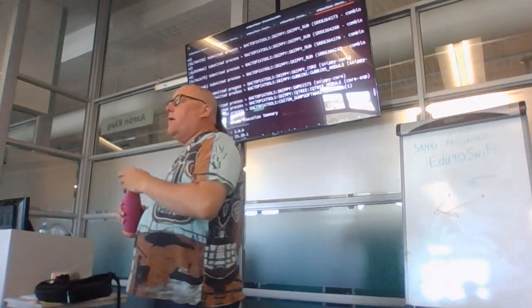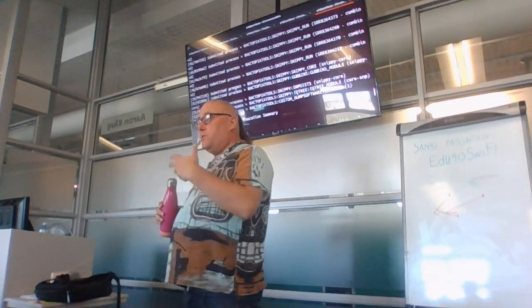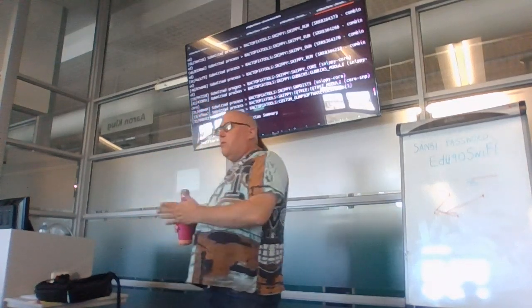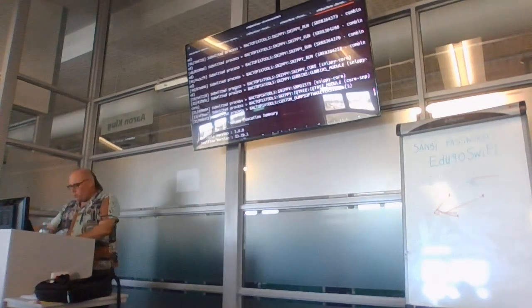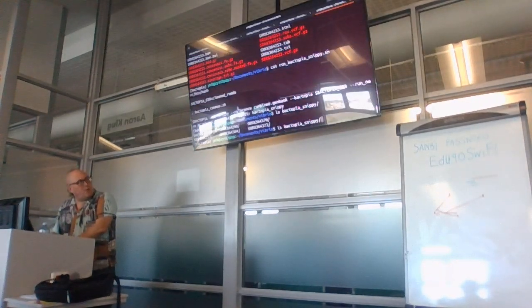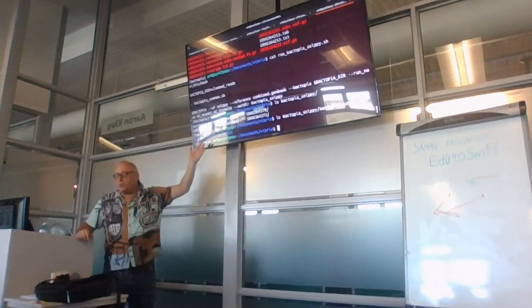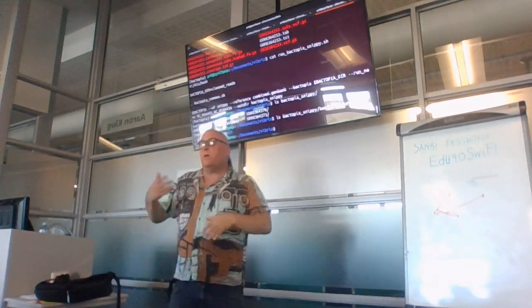So we saw yesterday in our Bactopia runs output, it was just the Nextflow log that let us see what processes Nextflow had run. But now if we look in the Bactopia runs directory, again, we'll get one of these files for every time that we've run this workflow. So if I run it another time, I'll get another file like this, okay?